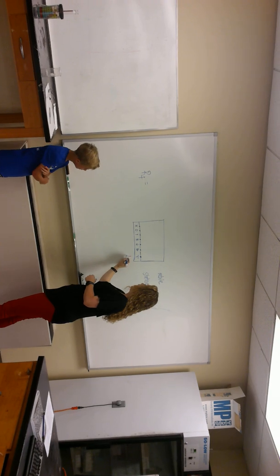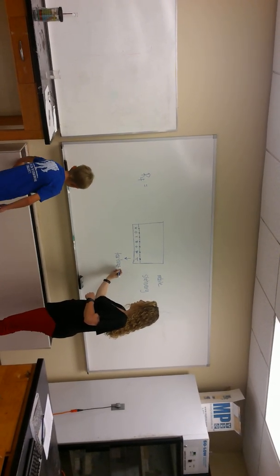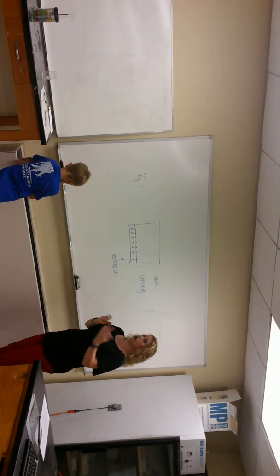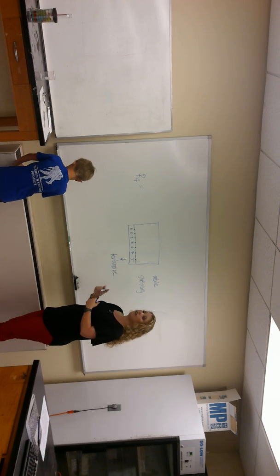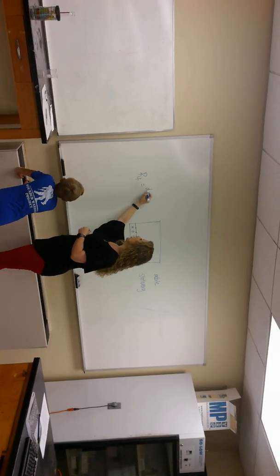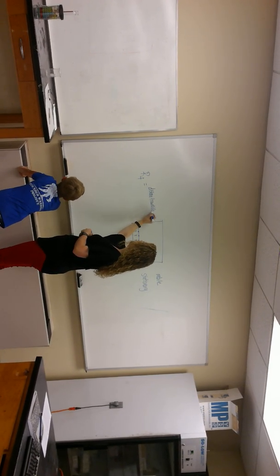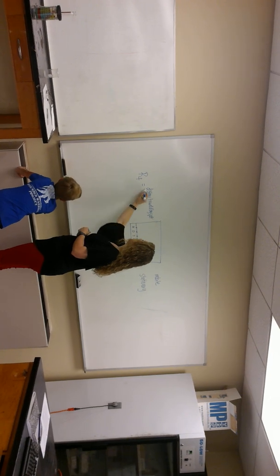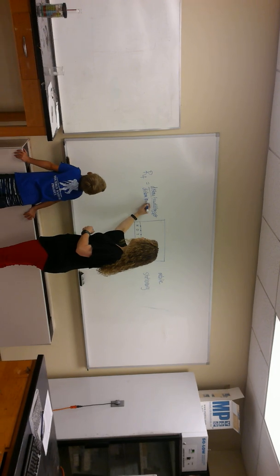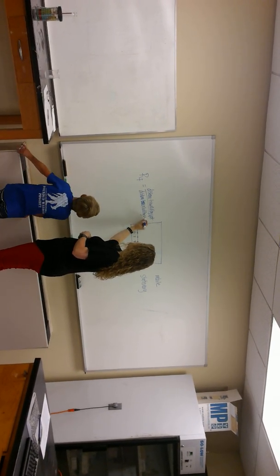Yellow dye number 5 has a chemical name and it's tartrazine. So we're going to use tartrazine as our standard. And we're going to calculate the RF factor for tartrazine. And RF is going to be our distance traveled by the spot over our distance traveled by our solvent.